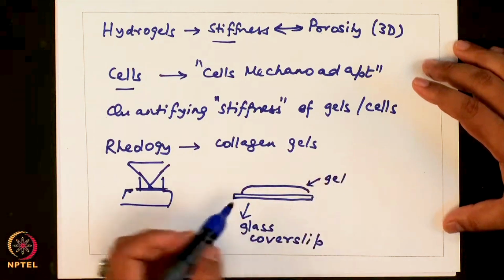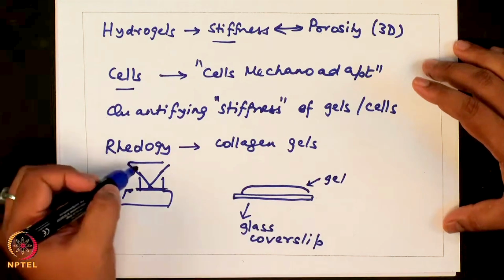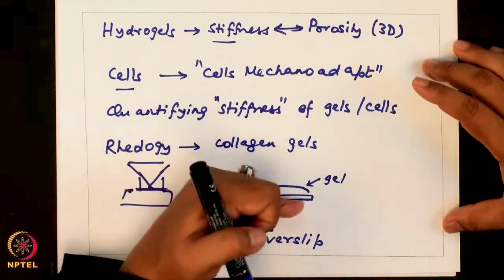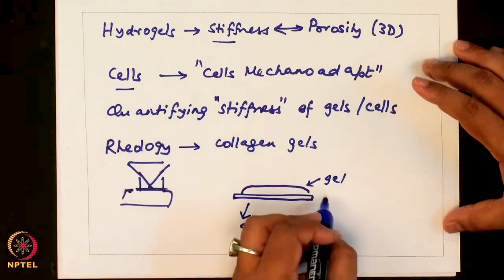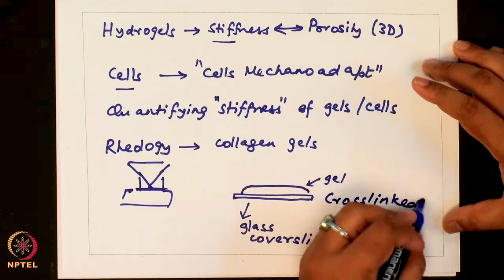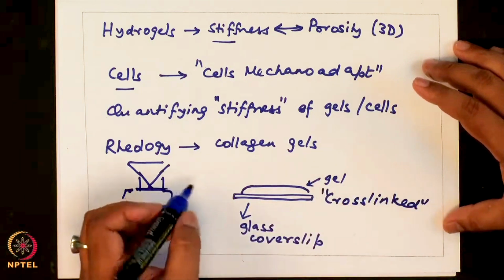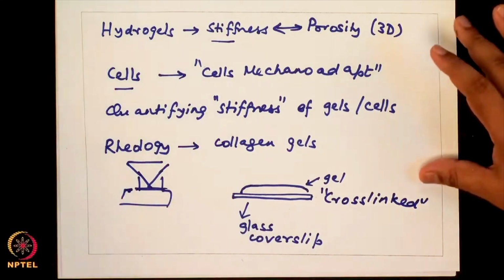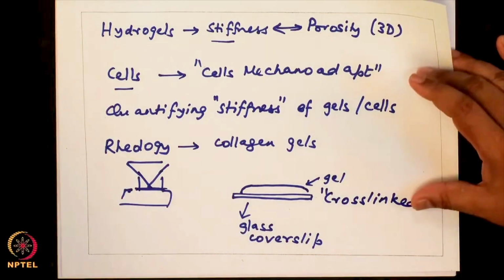Okay. So, in this case the properties that you measure in rheology versus you measure under the condition in which the gel is cross linked. So, gels are generally cross linked to the surface. Okay. The properties that you measure can vary greatly. Okay. So, what might be a different approach to quantify the properties of these, okay, and that is where the AFM comes in handy. Okay.